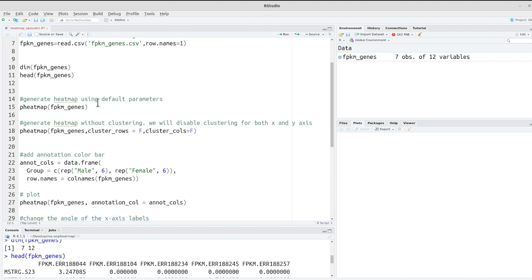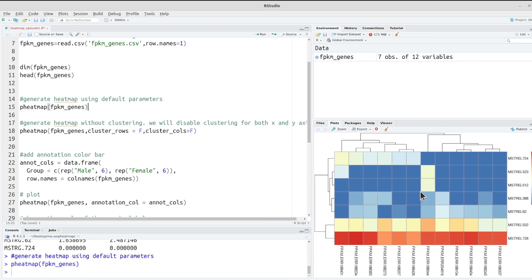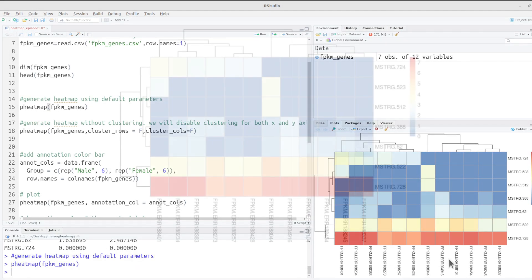Now we will generate our first heatmap. To generate a heatmap, assuming the data is in the proper format, you just call pheatmap() and pass it the data. Let's run this. We have our first heatmap generated using the default parameters.